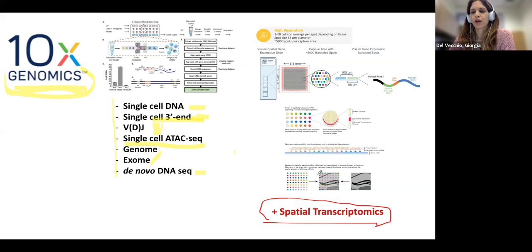Okay, so we are not just looking at what is expressed in one cell or another cell. We are looking at how the transcriptome changes based on the 3D structure of a tissue.